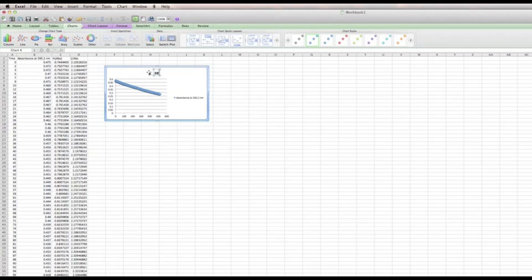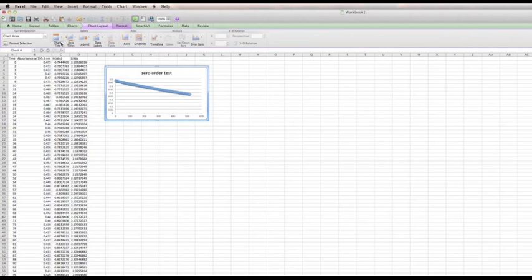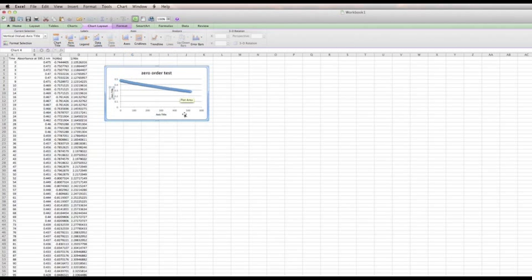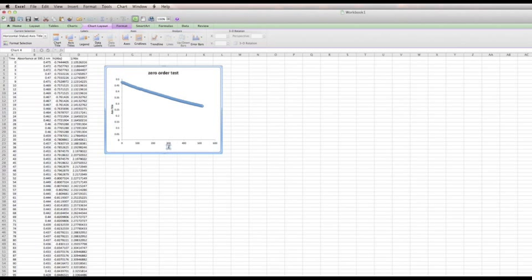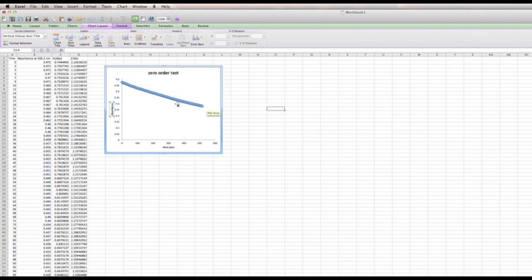We'll give this a different title — we'll call this the 'Zero Order Test.' To make a good chart, we need to add some axis labels. The x-axis is time in seconds, and then we label the y-axis as well. I'm not sure if the PC version is exactly the same, but the process is similar.